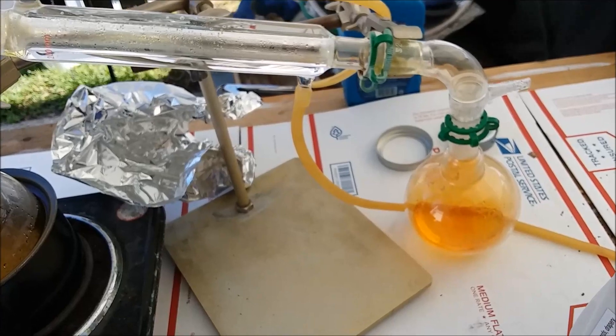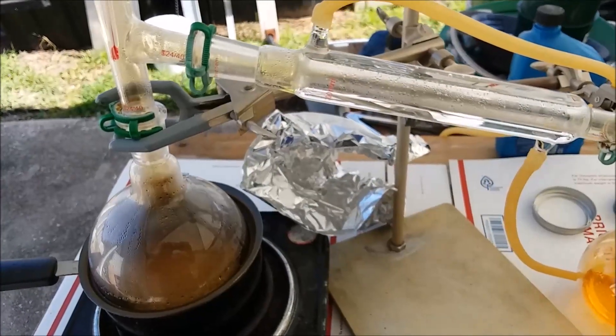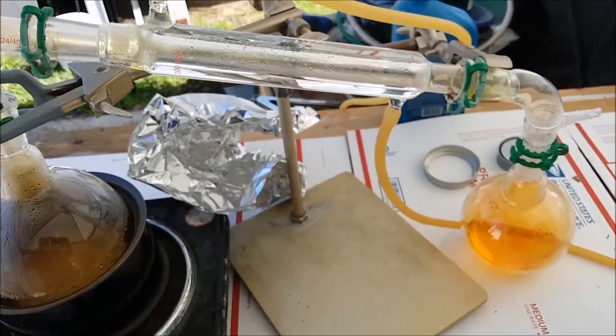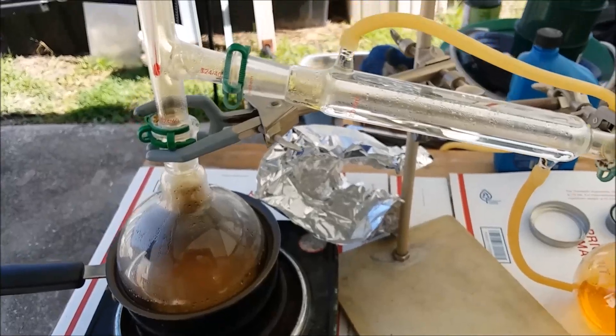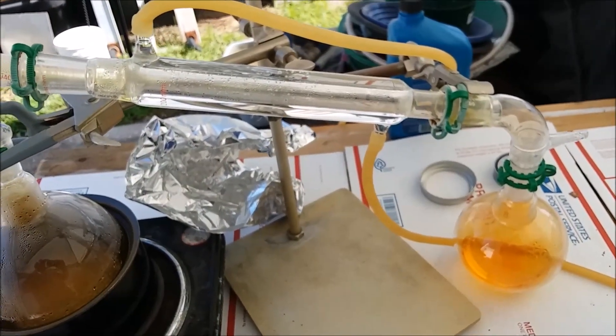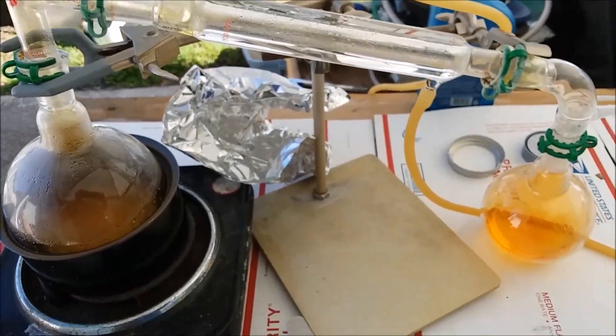I need to get some vinyl gloves to wear over the leather because vinyl doesn't seem to be affected by nitric acid too badly. I know it'll soak through the leather eventually and get to my skin, but the leather is better than nothing. I'll have a big face shield on and a leather apron, and hopefully I can get this all apart and cleaned without further injuries.